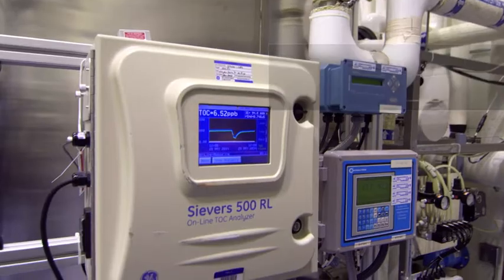The equipment we have here to monitor the water gives us very good reproducible data. This is testing that would have been normally done manually on the bench top by many chemists and takes a lot of time. This reduces the time that would be involved with the releasing of the water. So it gives us very good data, it's been validated, it's reproducible, and it's a very good functioning part of our system.